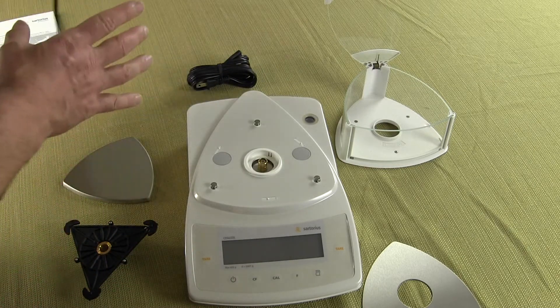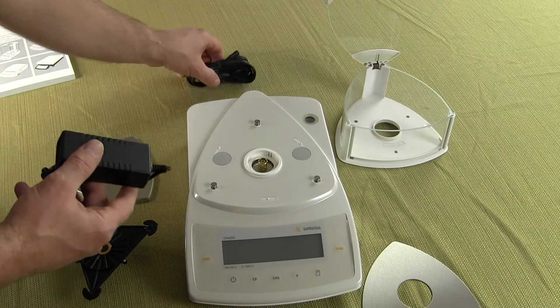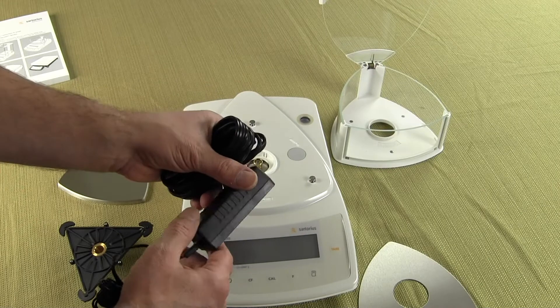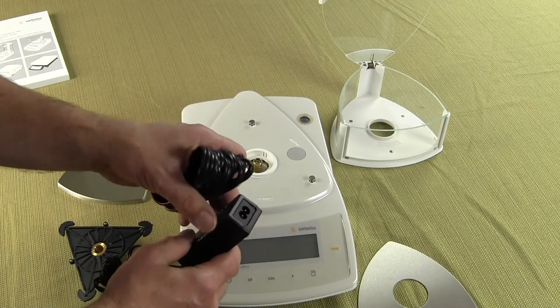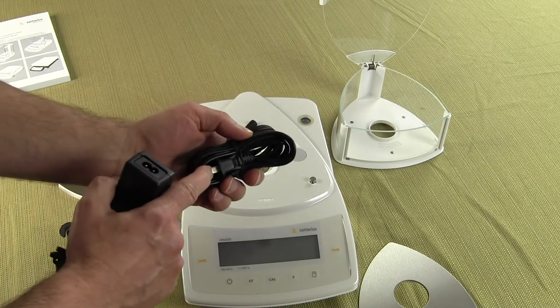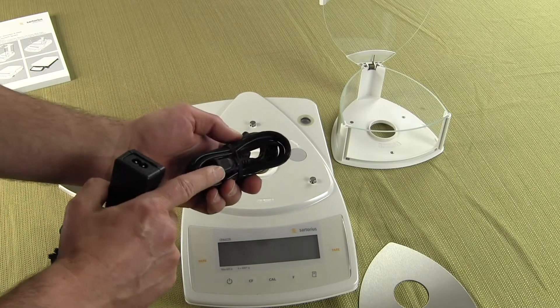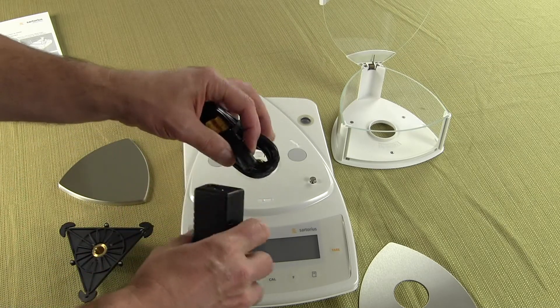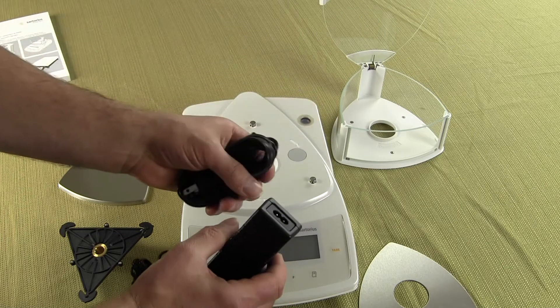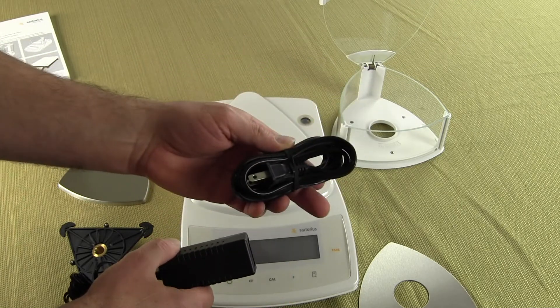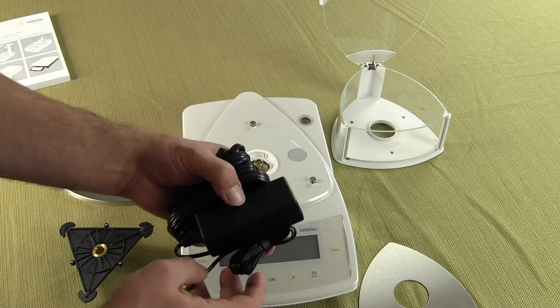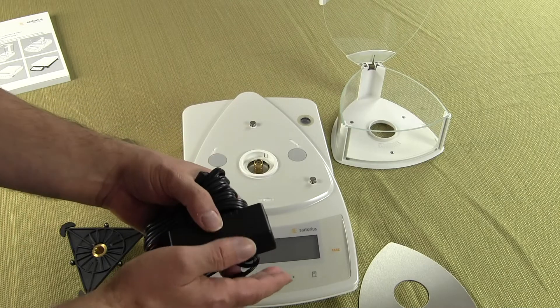We also have the power supplies. The new power supplies coming from Sartorius are universal. They'll automatically sense the voltage, the input voltage. So since we sell only in the US we supply the adapter. Typically in the United States you just plug into a 120 and then this connector just plugs right in. Now if this balance was going overseas and you need a 220, the only thing you have to change is your line cord. So that's a new feature that Sartorius just started implementing with their balances over the last year.